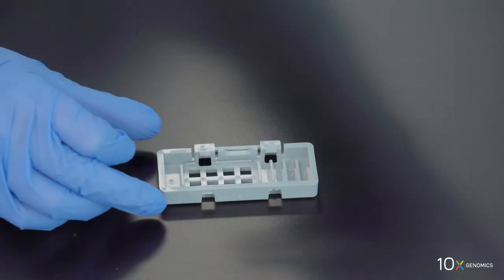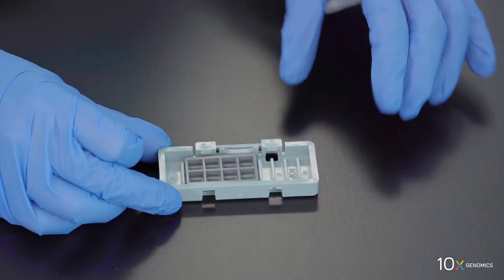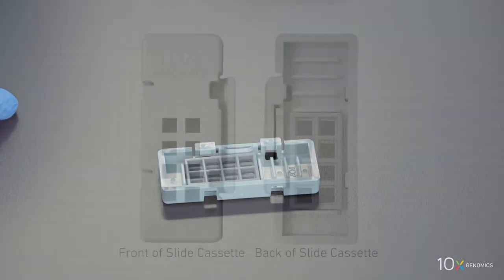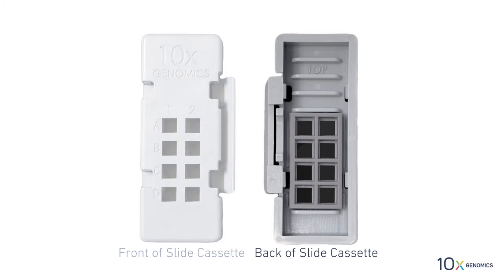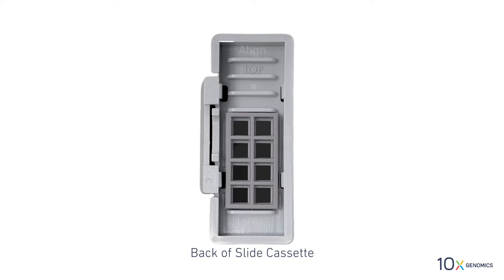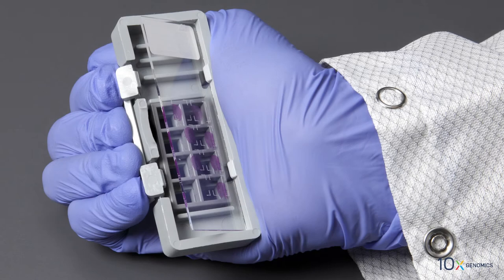Insert the gasket and align the gasket and slide cassette cutouts. Ensure that the back of the slide cassette is facing the user prior to assembly. Align the label on top of the slide to the top of the slide cassette. The active surface of the slide with tissue sections will be faced down such that the slide label is no longer readable.